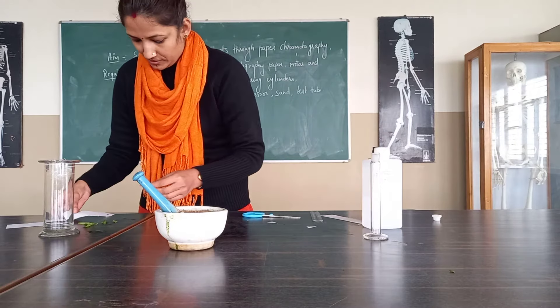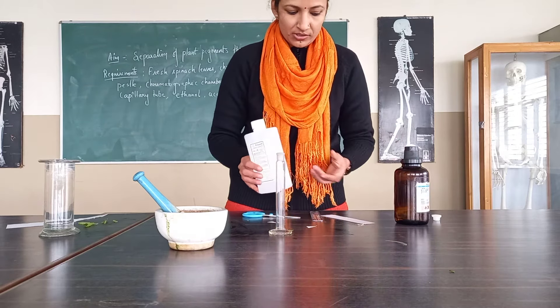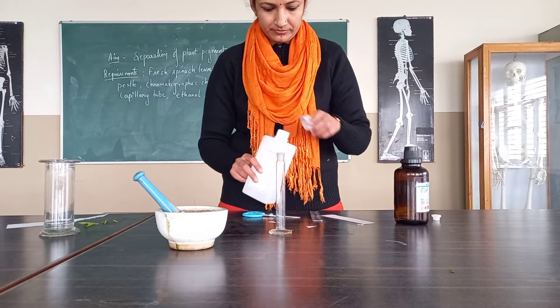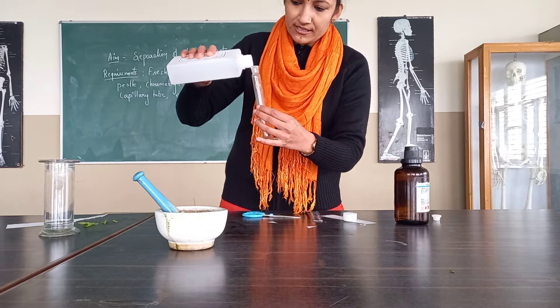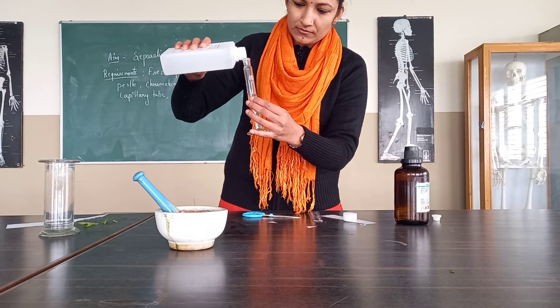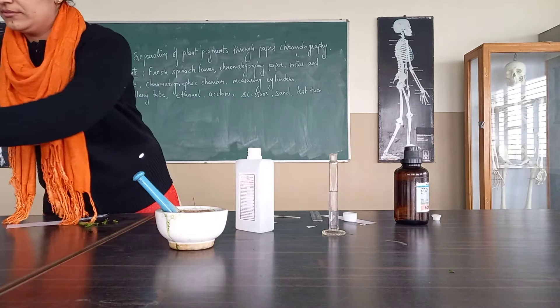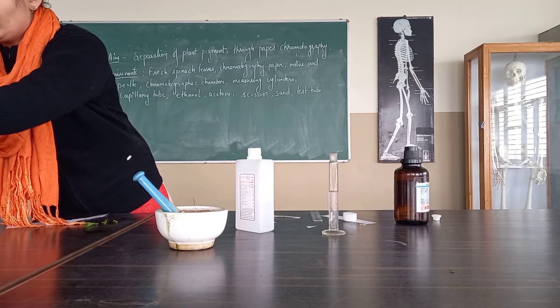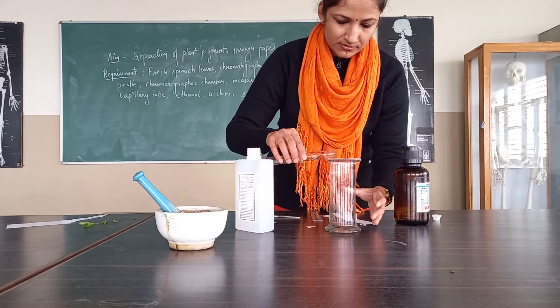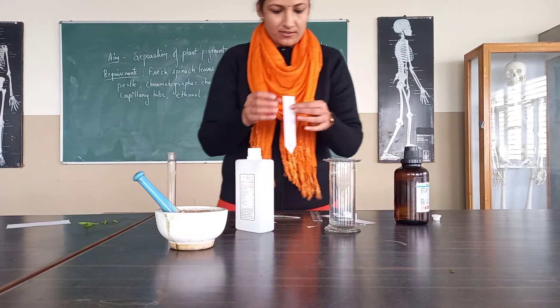Now, to prepare the solvent which we are going to use during this paper chromatography — as I have told you, we can use purely ethanol, so near about 20 ml of ethanol we can use. By using the measuring cylinder, we will measure it. We have taken 20 ml. We will pour it into the jar, as we have tied one thread over it so that the paper can be placed on it.